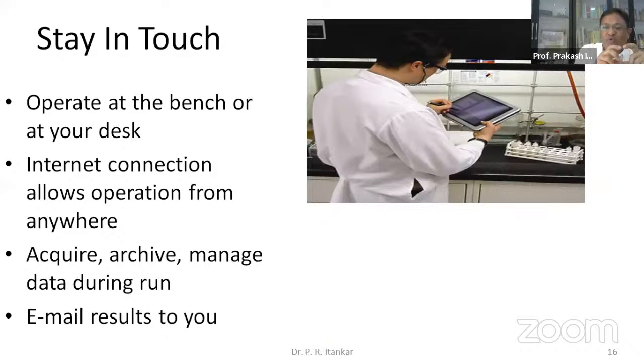Now the test tube has a volume of say only 15 ml, and if almost 100 ml of your eluate is coming, then a number of test tubes would be needed. Say, for example, 10 ml is collected in each test tube, then you would need that complete fraction to be collected in 10 test tubes.